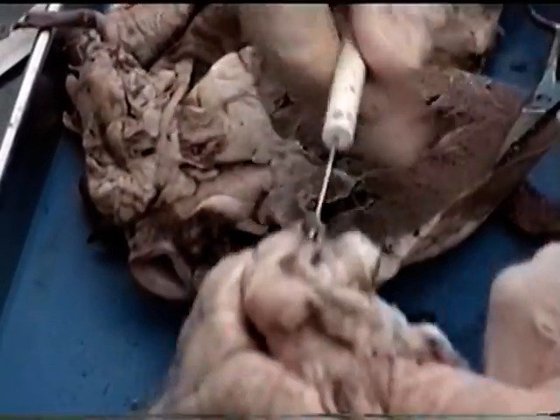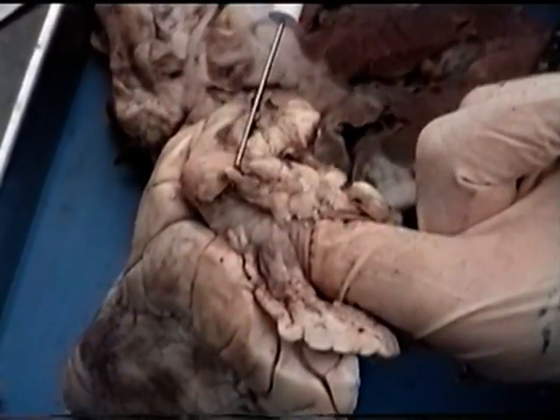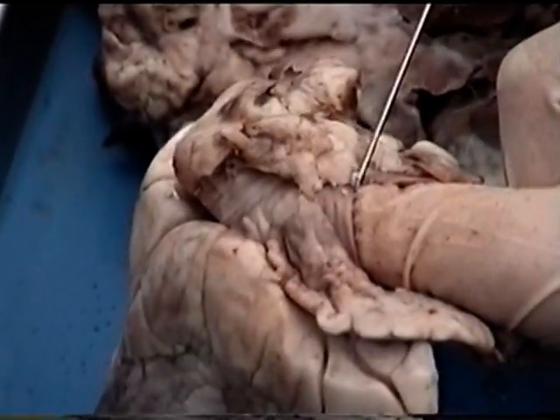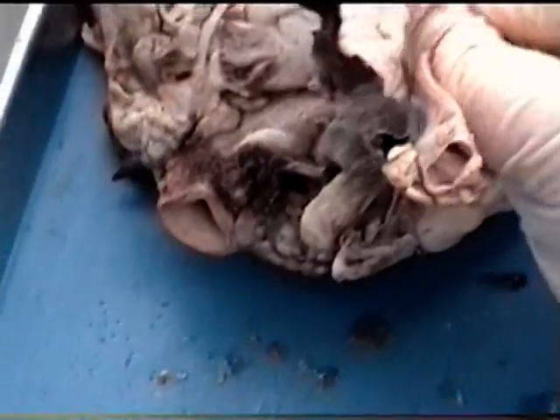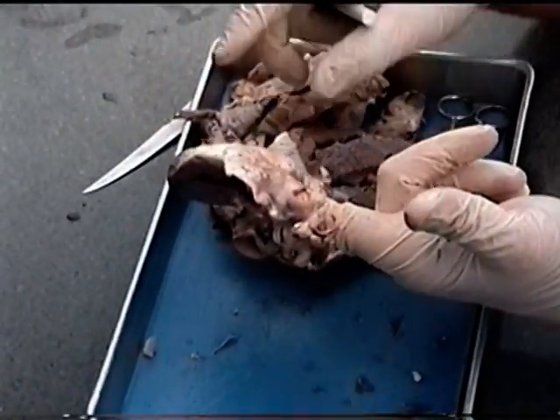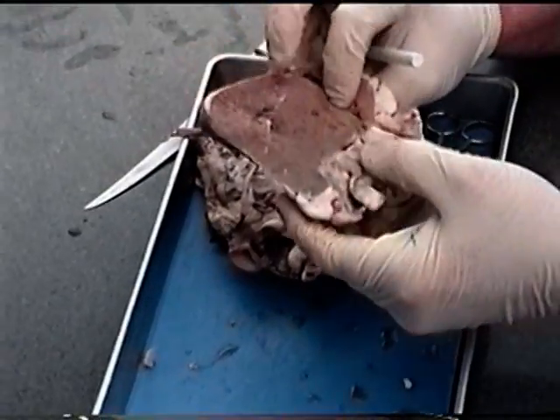If I follow that downward, I should be able to find another opening through which I can stick my finger. That's in the right atrium here. So my finger is right here sticking through the inferior vena cava, and I'm entering the superior vena cava right here. And both of those blood vessels are associated with the right atrium of the heart.